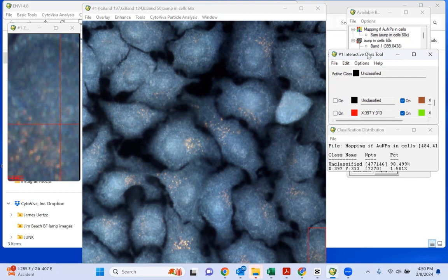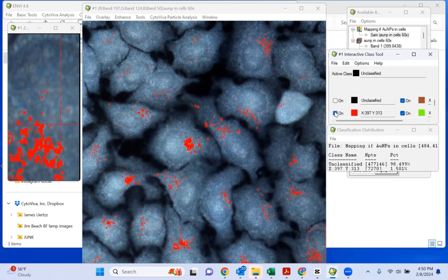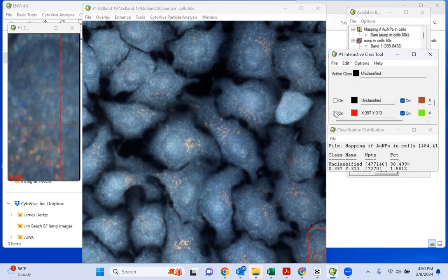A way to quickly identify these is by using a tool we call spectral angle mapper. And here, all of the pixels that are turning red are indicating the spectrum from a library made from these gold particles.